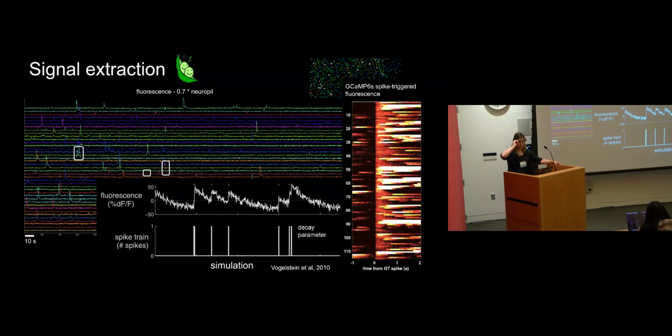So in practice, we discourage people from discretizing because we don't think it's very possible with GCaMP6, and you actually end up losing information in your traces if you discretize, rather than using all of the information about what the spike probability is.